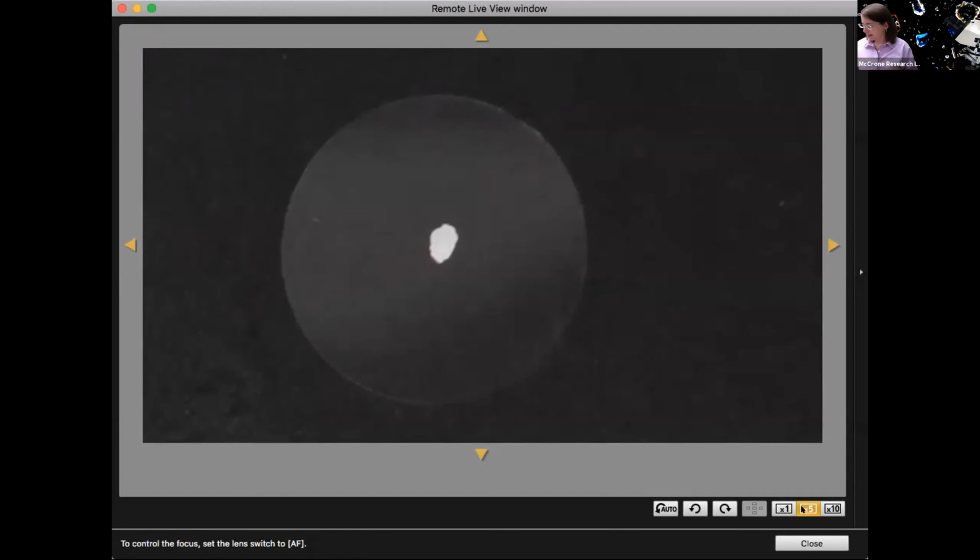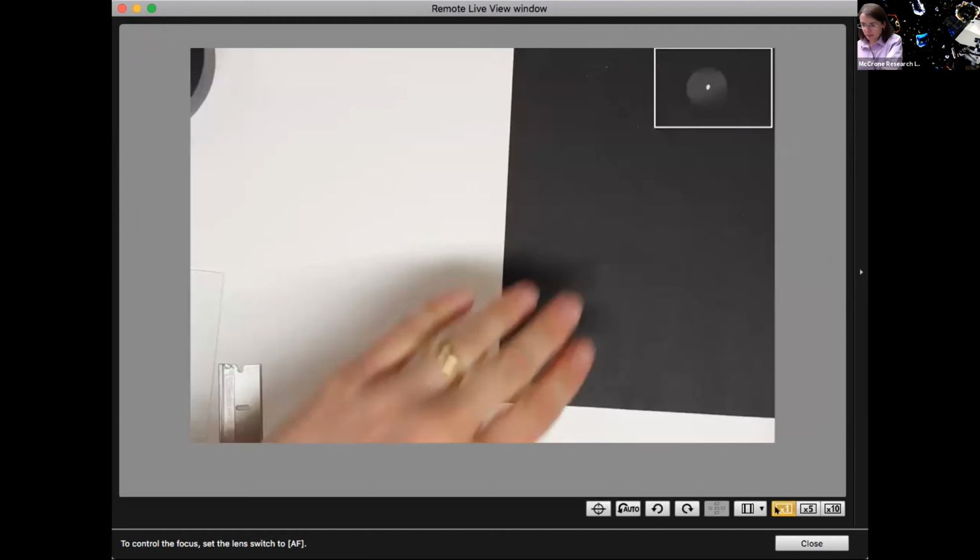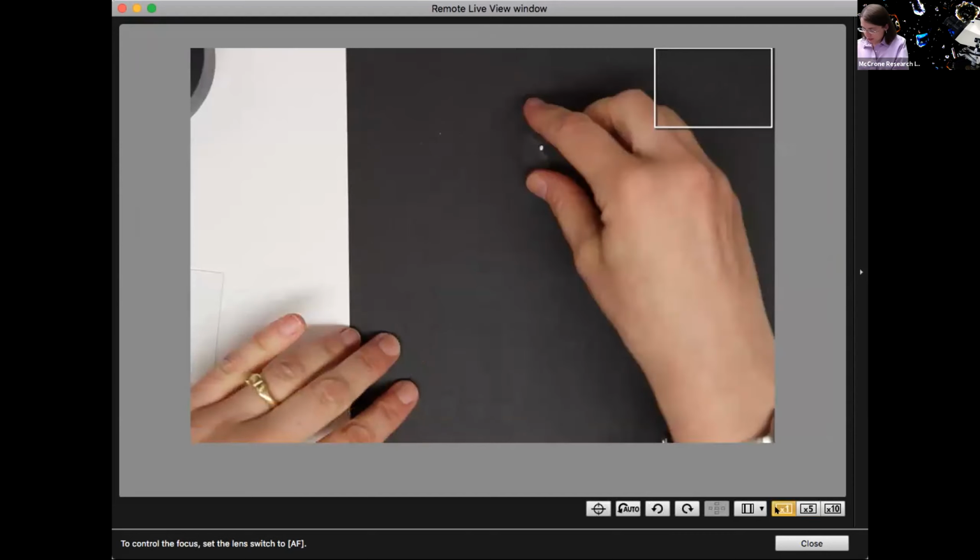I've also had success. I used some black quick drying nail polish that actually seemed to work okay as well, or some sort of black enamel paint, but the correction fluid works nicely. So I would certainly make several of those, because there's always going to be some amount of trial and error. Okay, so let's head back over here. So that's how you make them.